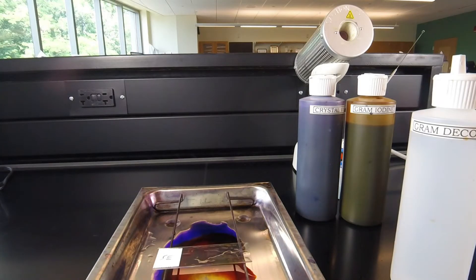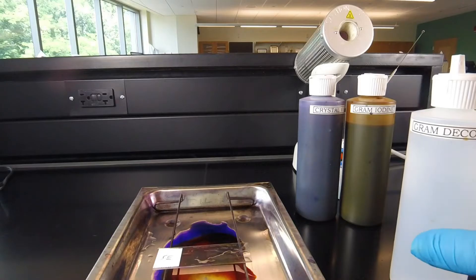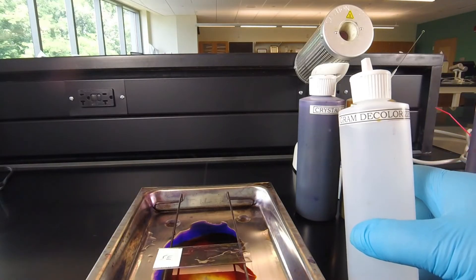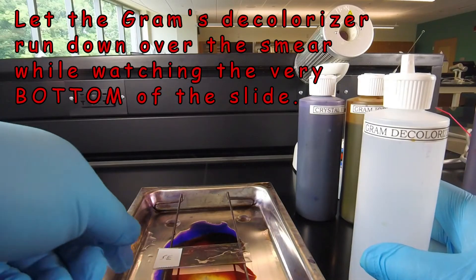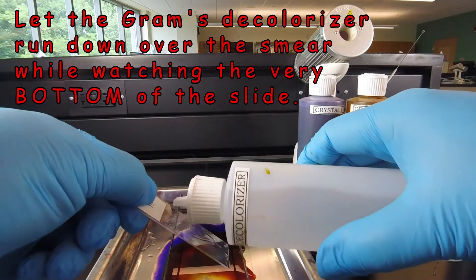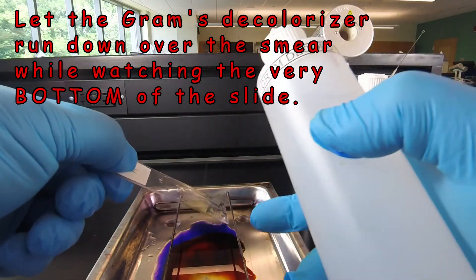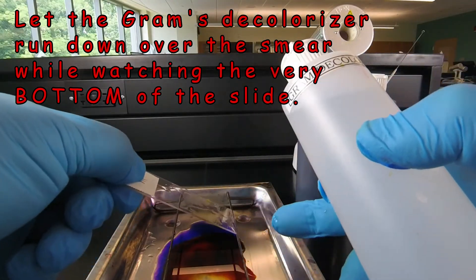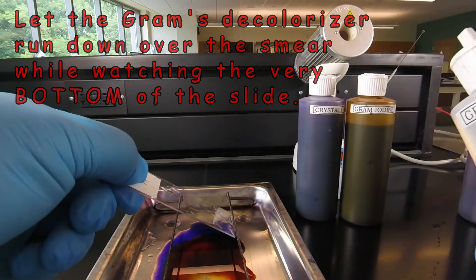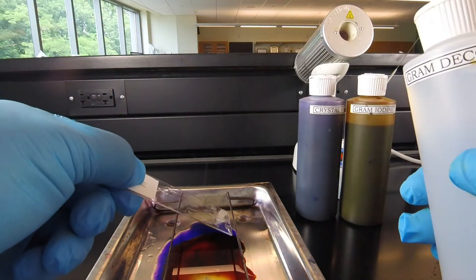The decolorization step is our next step, and this is the most critical step during the Gram stain. You have to do this very carefully because you can over-decolorize or under-decolorize. We're going to use Gram's decolorizer, a mixture of ethyl alcohol and acetone. We're going to direct the decolorizer down over the slide while going back and forth with the decolorizer bottle, letting it run down over the entire smear. As we do this, we're going to be watching the bottom of the slide, not the smear, but the bottom, watching the purple come off from the crystal violet iodine complex.